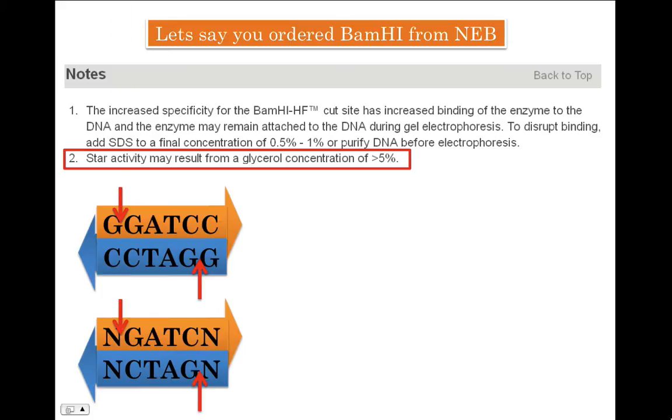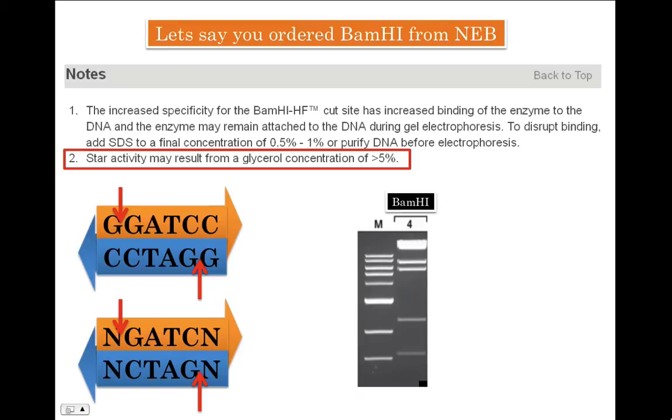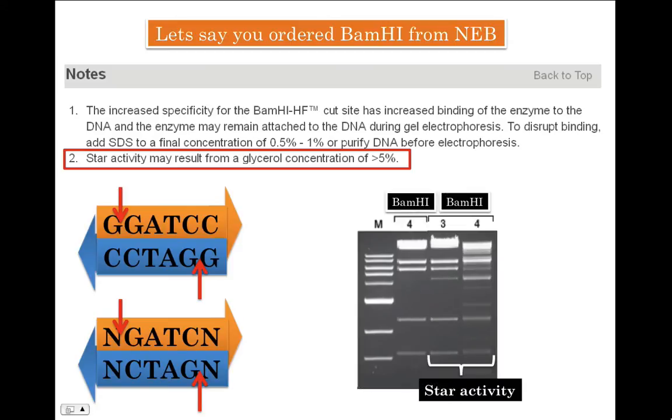Let's imagine BamHI cuts a particular DNA which looks like this upon gel electrophoresis. However, upon star activity, the same restriction digestion will look somewhat like this — you will end up with more bands because BamHI has become non-specific and identifies many more sites to cut than simply GGATCC. Of course, you don't want that to happen, and you can avoid star activity by doing careful calculations.